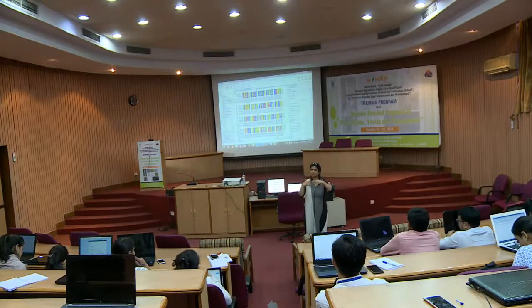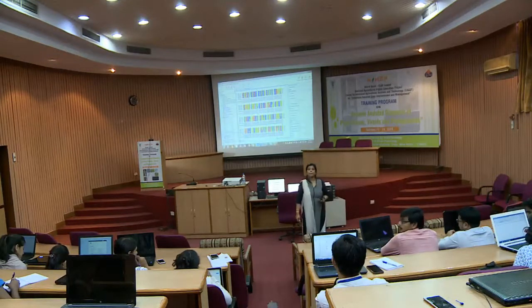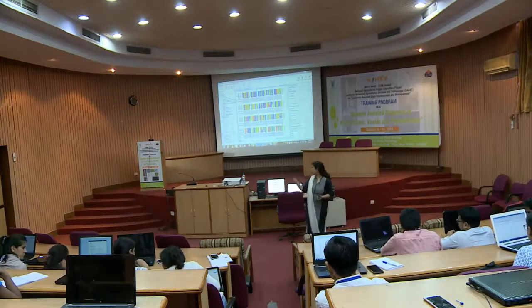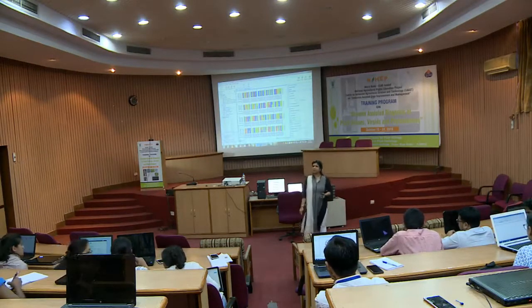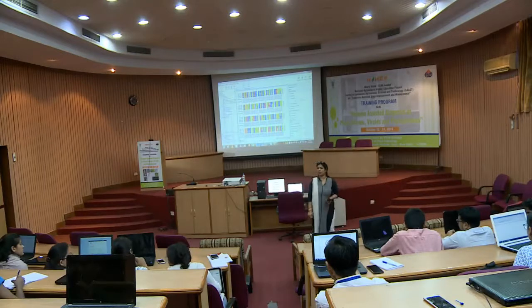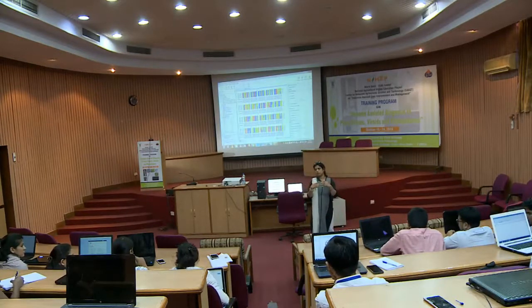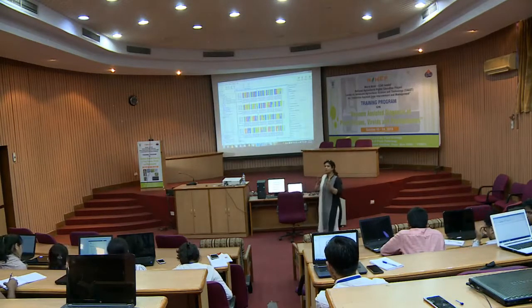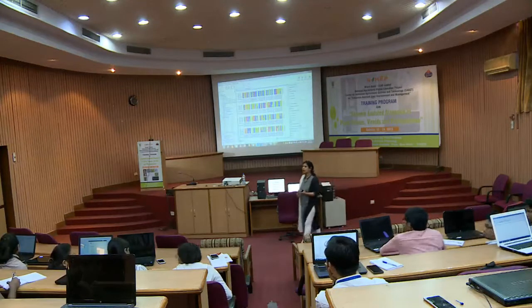Either you will consider this or it will cumulatively form one. That means we don't need to do any consensus sequence? No, how come consensus, why do you require consensus here? Since you have two sequences and you want to join those two sequences, that is the Contig formation. That is a Contig formation. Okay, that is a different one.